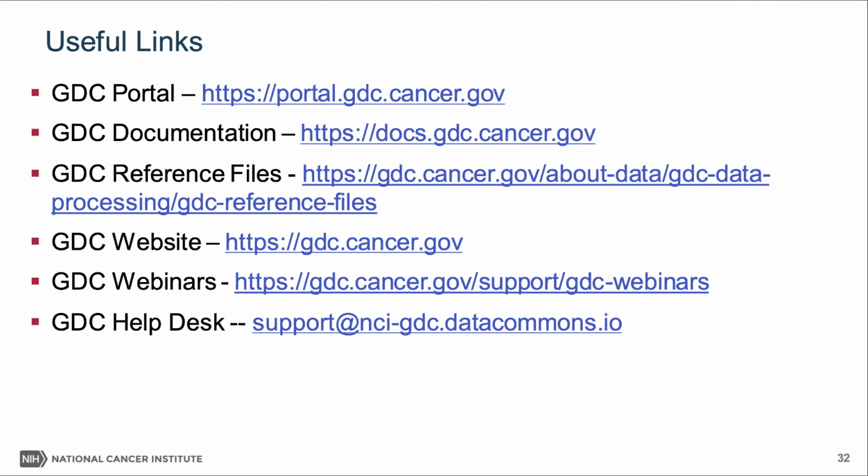They also provide a very good use case of how they used the data derived from this workflow to identify something interesting that you wouldn't find with the older analysis and that was only available with the new Sesame analysis. So that's something you probably want to look at as well.